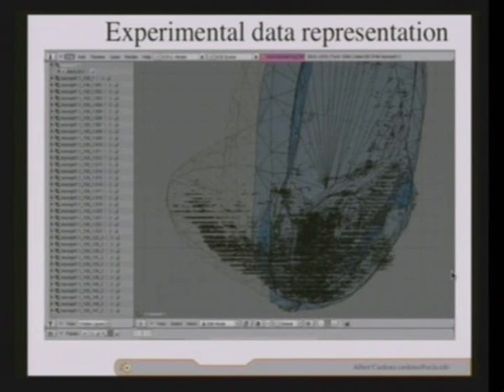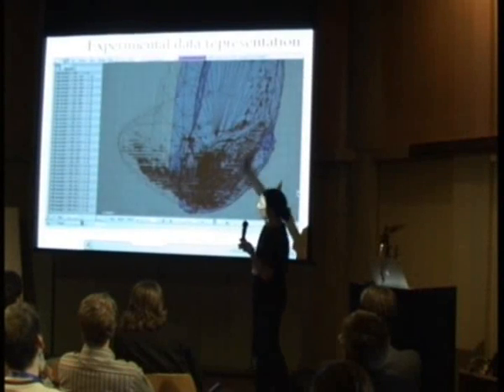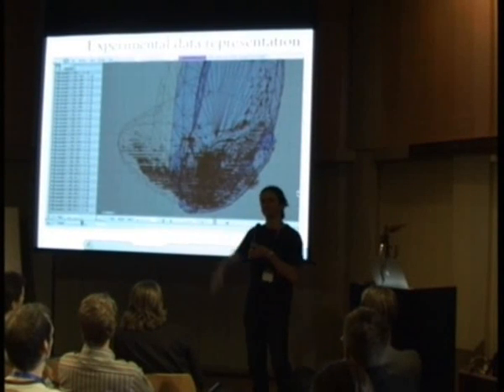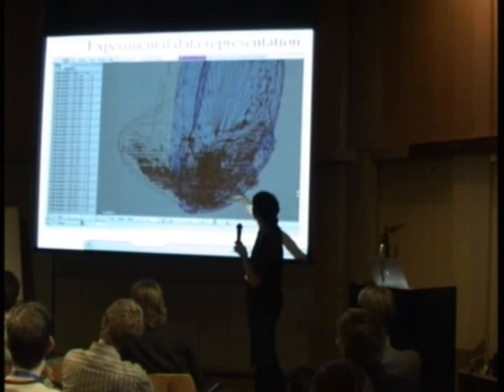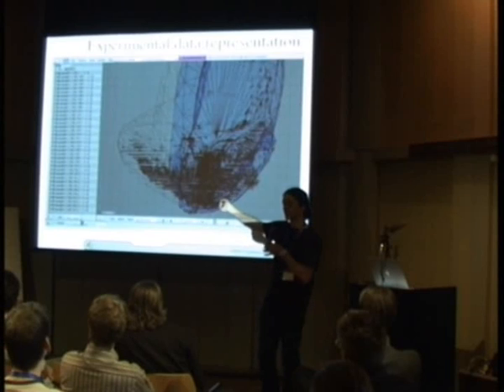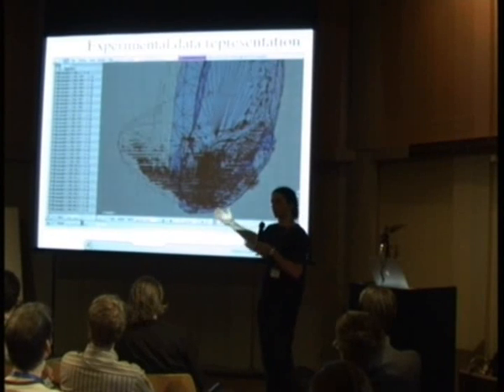And this is my own crazy stuff late at night. I'm just trying to push the limits of Blender by asking how can I represent my images, my data, inside Blender in a way that I can look at it. In here, this is an outline of a neuropil, let's say where all the neurons are projecting to, and all these black dots are actually synapses, where two neurons are interacting.